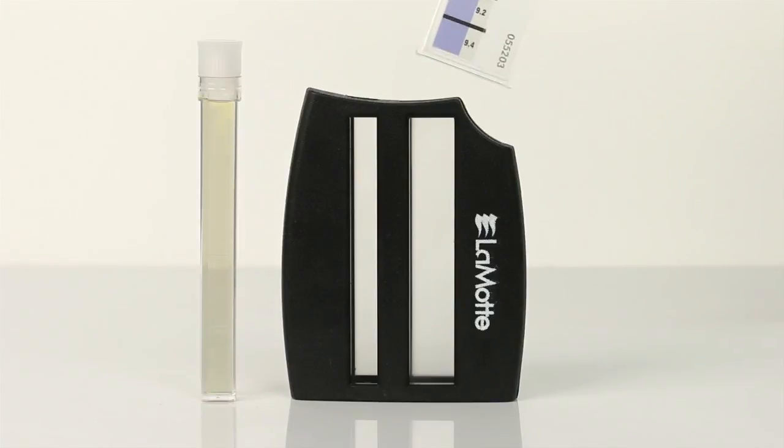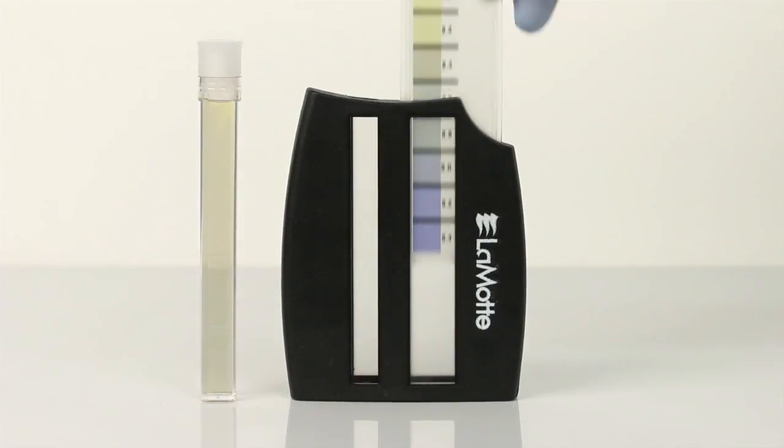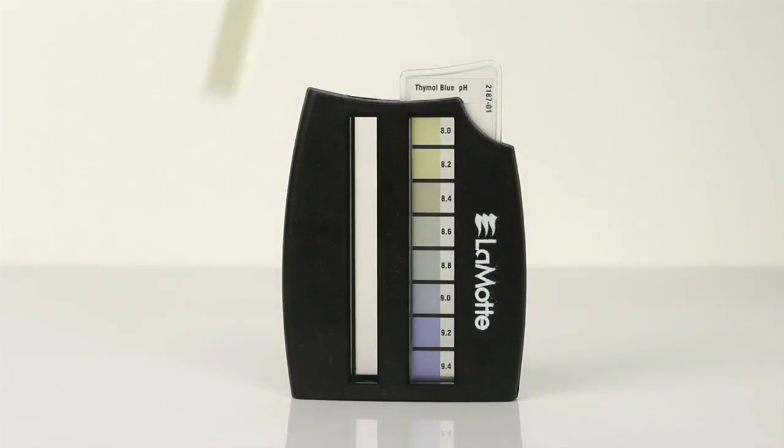Insert the Thymol Blue Octaslide bar into the Octaslide viewer and place the vial into the viewer as well. Match the color of the sample to the color standard. Record results as pH units. The Octaslide viewer should be held so non-direct light enters through the back of the viewer.